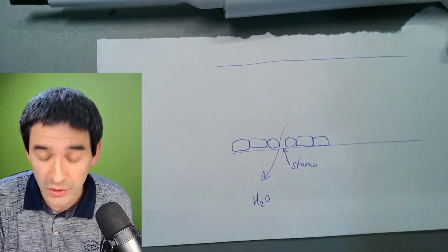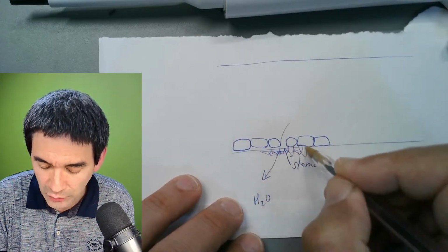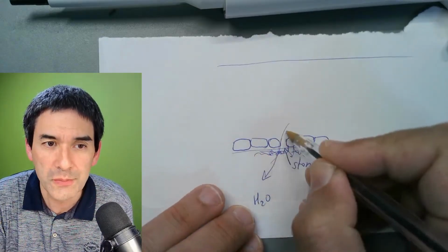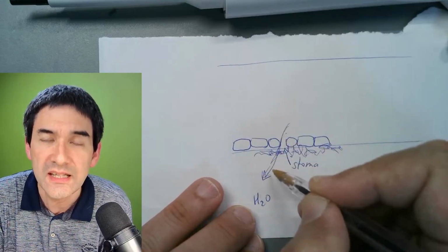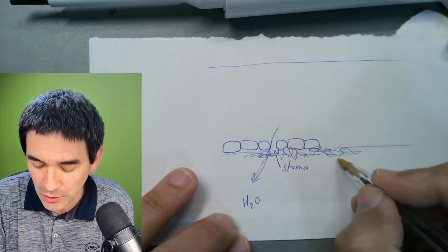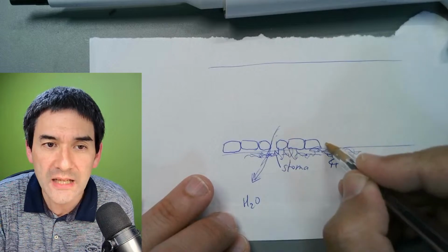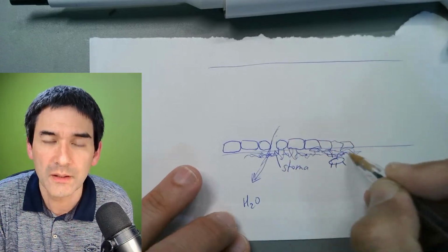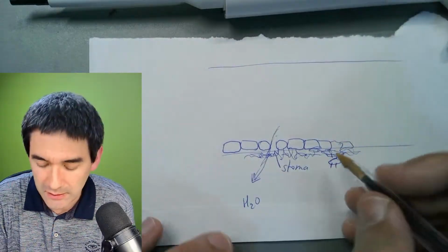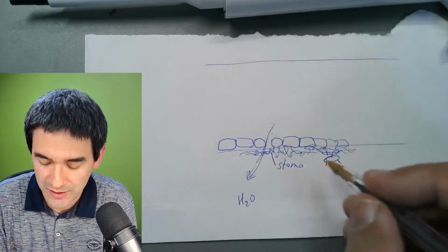And the plants lose a lot of water. So in many plants, they have those trichomes growing here on the bottom of the surface, and this reduces the water loss because the water cannot diffuse out as easily here. And this fuzzy layer, those trichomes, as I just mentioned, also prevent it: if there's an insect over here, then it also has a problem reaching the actual plant cells. So it's not able to drink the sap of those plant cells, right? So as you can see in biology, some structures actually have multiple functions.